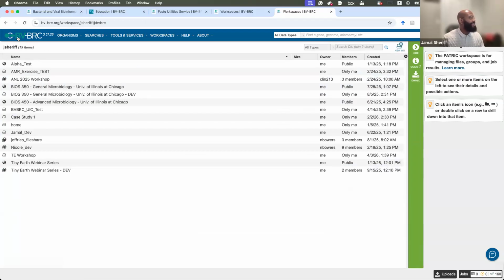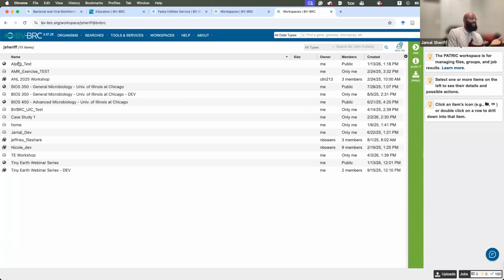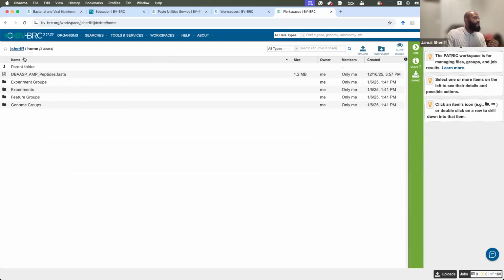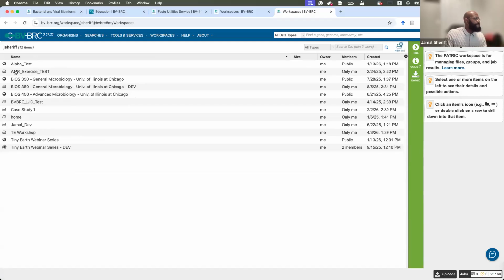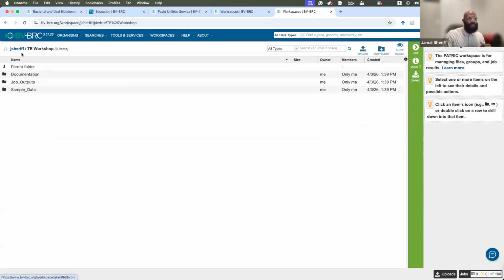And if you were to go back to your home page, I did that by clicking on my username. Oh, well, technically it's going to have my username. So for you, you'd want to go to workspaces in the drop-down menu and then click on, sorry, my apologies, click on my workspaces. And in that list, you should see the workspace that you just created, and it has the three folders that are copied over. Now you have everything you need to go ahead and get started with our workshop for part one. And then I'll have a brief moment after we submit our FastQ utilities job.